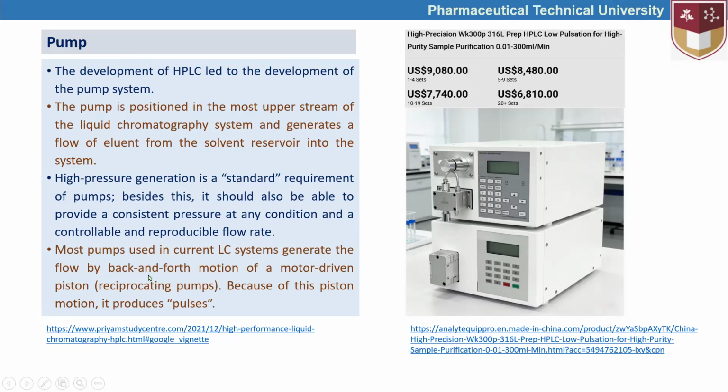Most pumps used in current liquid chromatography systems generate the flow by back and forth motion of a motor-driven piston. And because of this piston motion, it produces pulses.